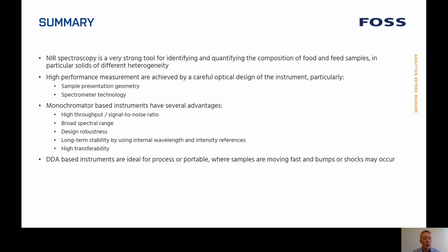Furthermore, it's possible to manufacture monochromator-based instruments that are so identical that we can achieve a transferability that is better than the repeatability obtained when repacking the sample. Finally, we've also seen that DDA-based instruments are ideal for process or portable applications where samples are moving fast or bumps or shock may occur.